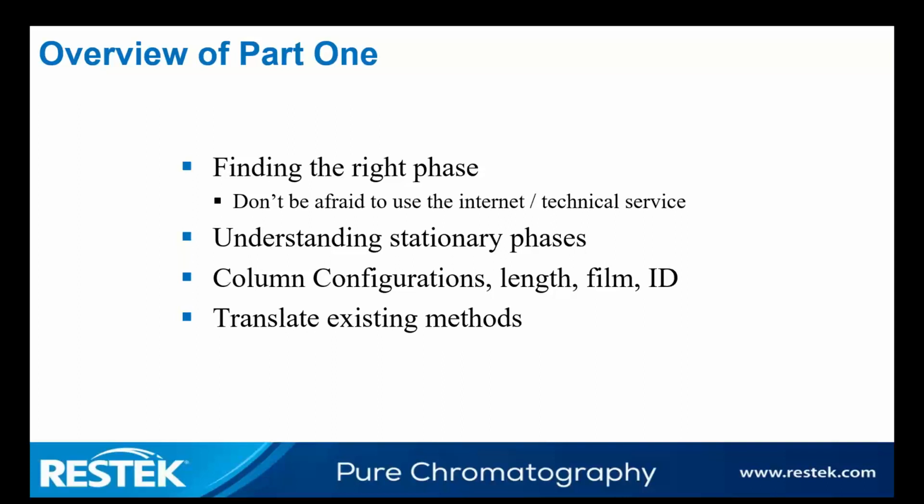So that might require an understanding of different stationary phases. Many of these stationary phases were tuned specific to compound lists. So if we have something that's got phenyl in it, that's appropriate for aromatic type compounds. Whereas if we have something like an RTX 200, which is a trifluoropropyl polysiloxane stationary phase, that works well with freons and halogenated compounds.